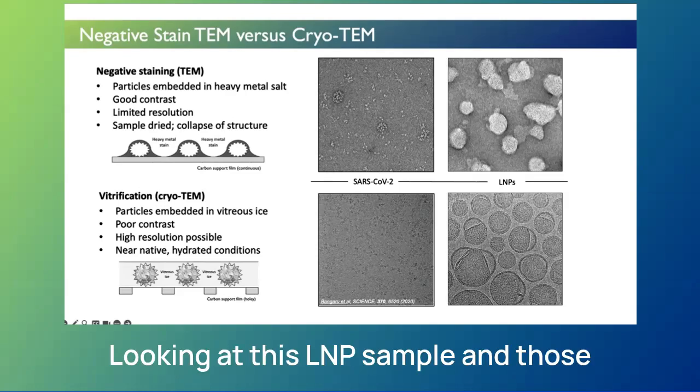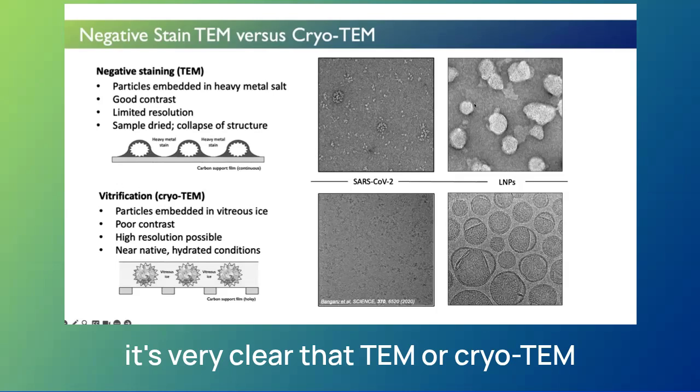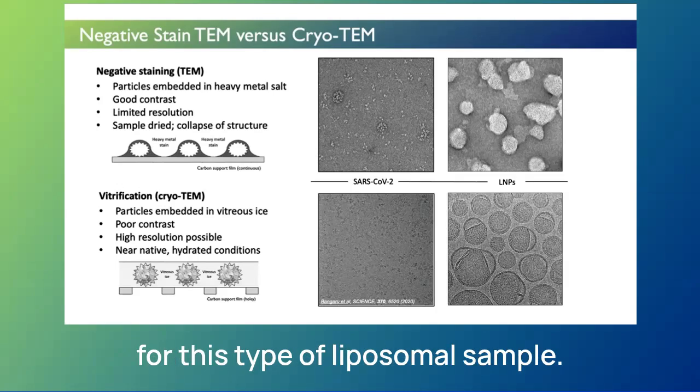Looking at this LNP sample in both Cryo-EM and negative stain TEM, it's very clear that Cryo-TEM is really the superior technique for this type of liposomal sample.